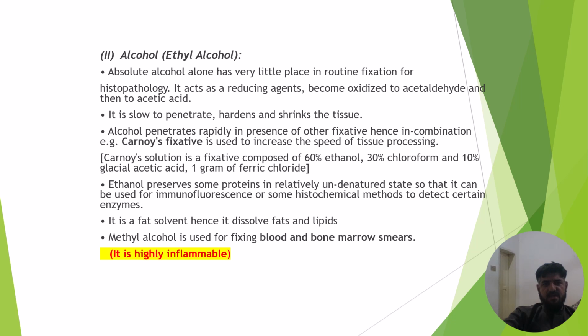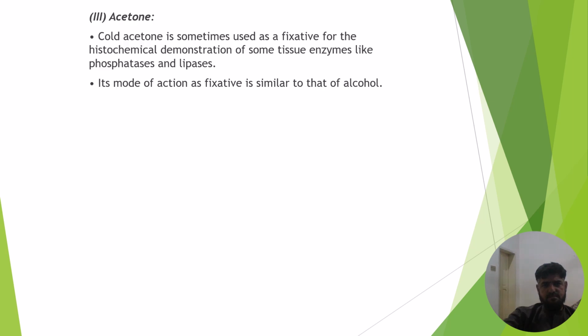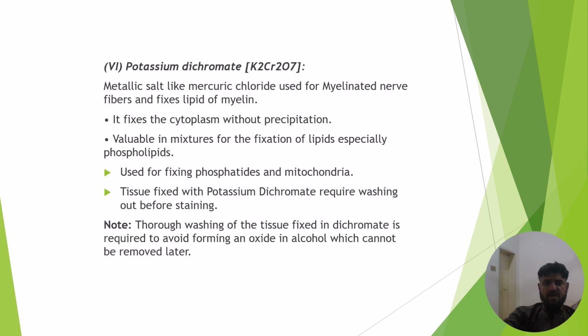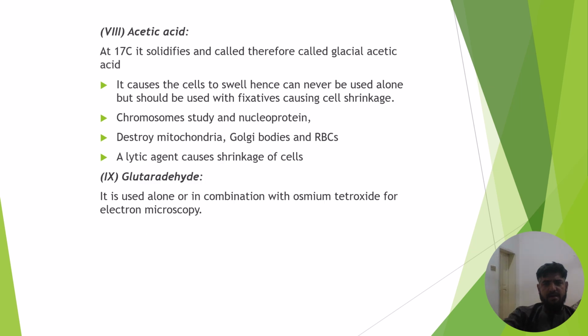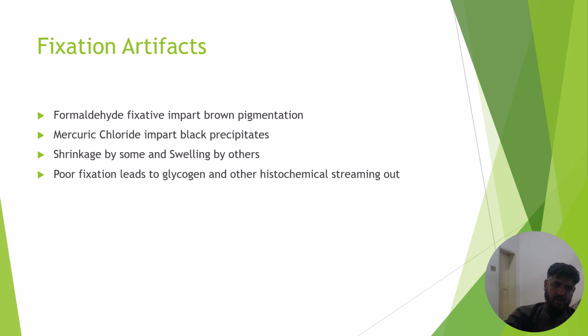Other examples of the simple fixatives are ethyl alcohol, acetone, potassium dichromate, osmium tetroxide, which is an oxidant, and acetic acid. Now we will discuss compound fixatives.